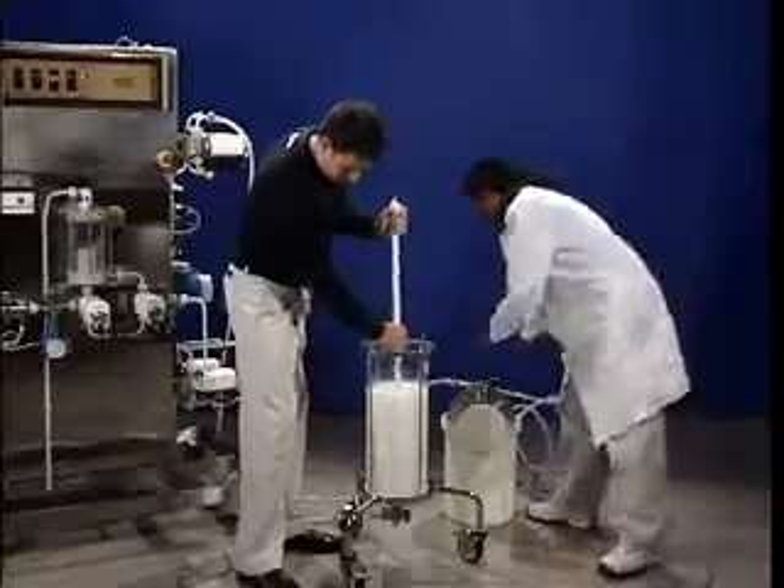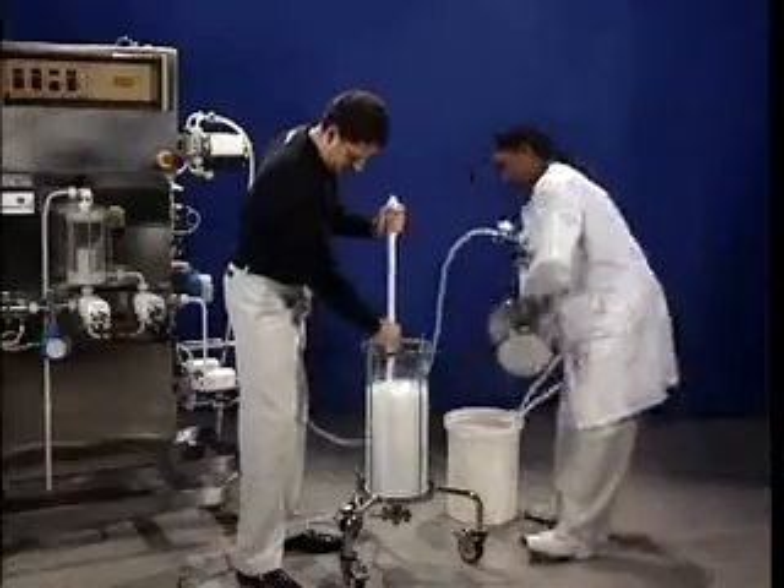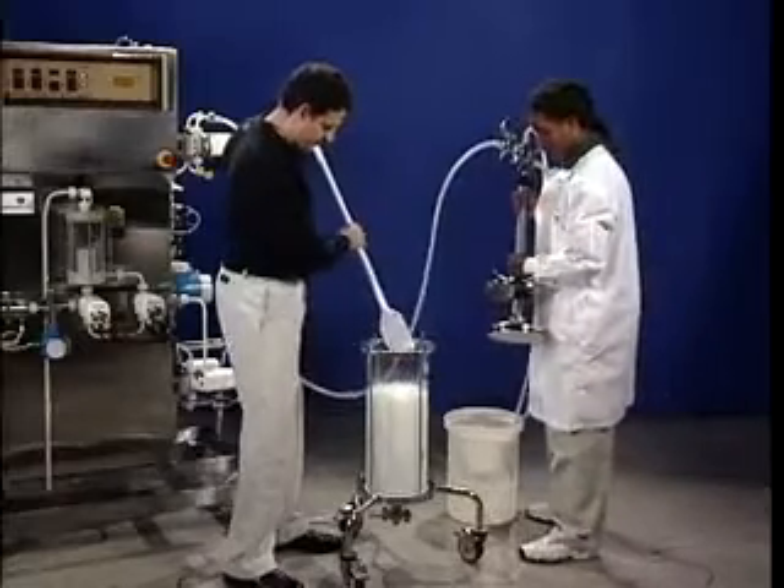Our first column packing method is called constant flow packing. We'll be packing Q-Sephyros Fast Flow to a 20 centimeter bed height in a BPG 200 column with a 50 centimeter tall tube. We're ready to start after we give the slurry a final stir to make sure it's homogeneous. Once we stop stirring, we've got to go ahead or the gel starts settling.